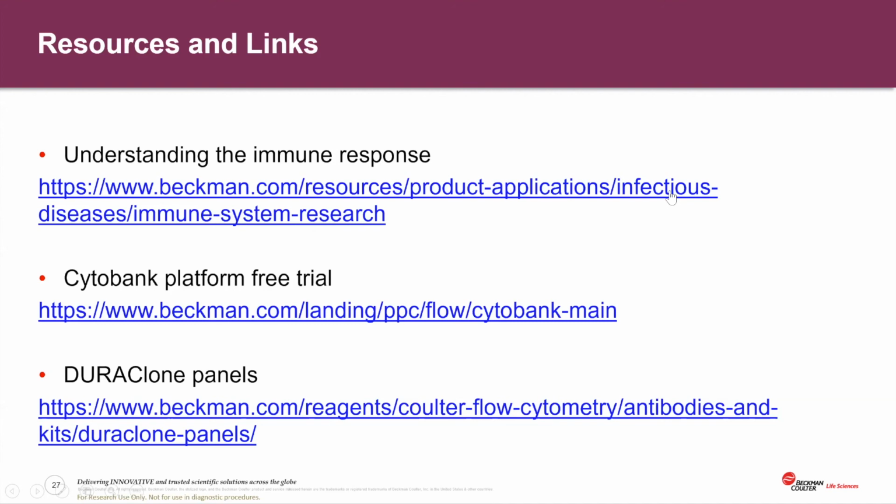Great. And as a follow-up to that, as we only have about 30 seconds left, I think a big part is controls, right? And the appropriate controls to have the correct compensation. Okay. So it would be an important thing to note there as well for reproducibility.